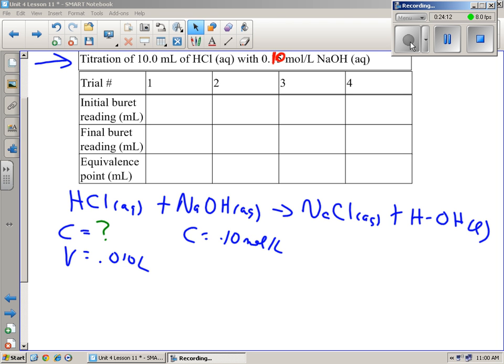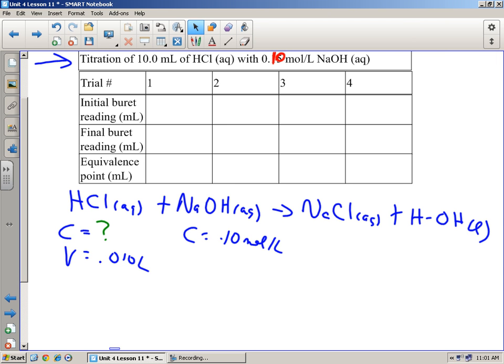When I add some base to this, you're going to see, okay, you see it's changing pink there. Now, what's happening is the base that I'm adding is reacting with the indicator at that specific point, and it is turning pink, of course, because bases with the indicator are pink.